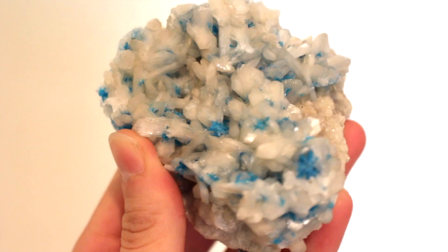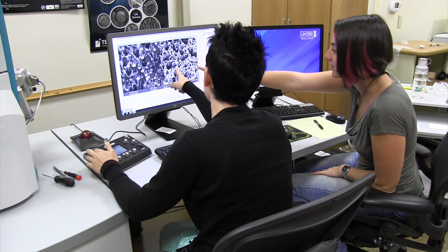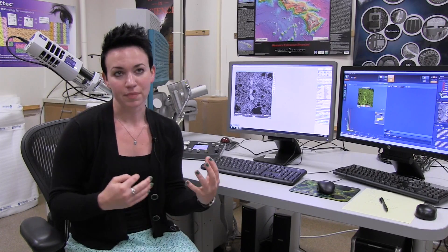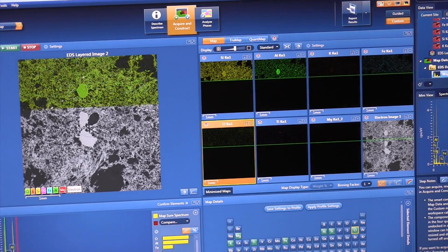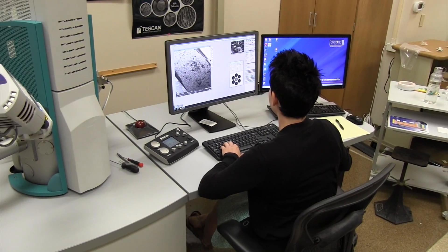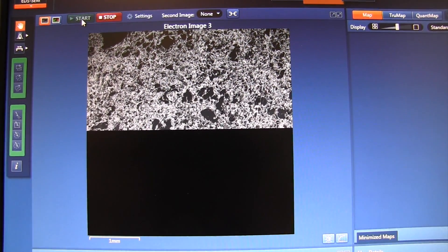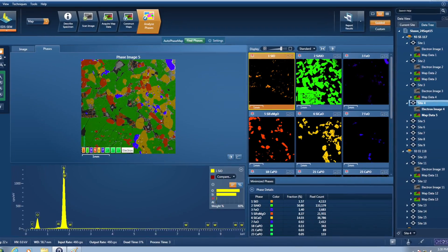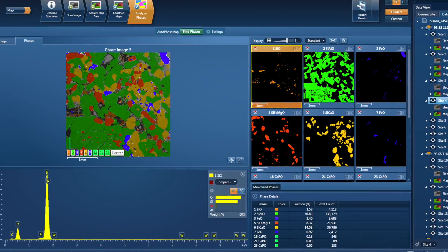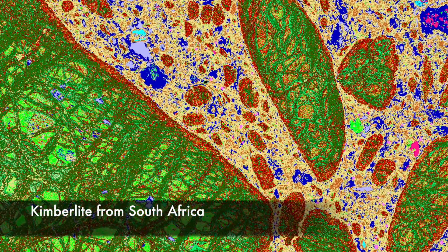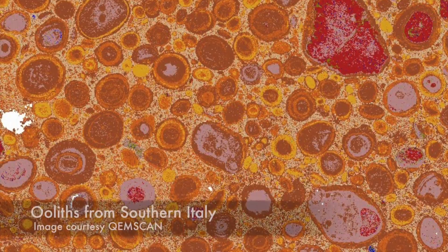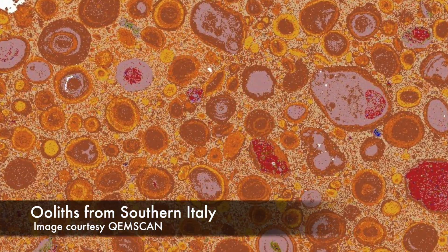When we work with the SEM, a lot of times we want to know one of two things: the chemistry — like what is this mineral — or we want to know the structure, size, particles, stuff like that. But sometimes we just want to know the spatial distribution of the chemistry, so this part is richer in iron than that part. In that situation we can do element mapping — we choose an area of the sample, run the beam across it, and it picks up all of the elements it finds on its raster of that image and produces a map of each element. You can see areas of high concentration and areas of low concentration, which helps to see the distribution.